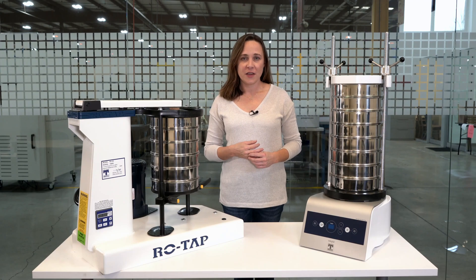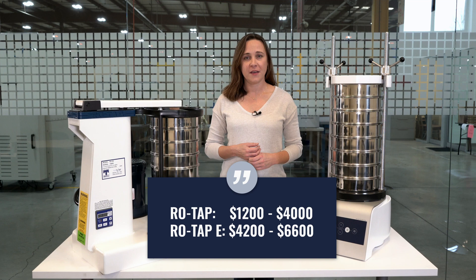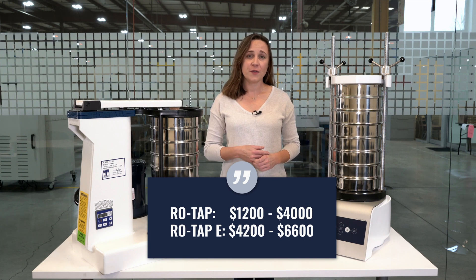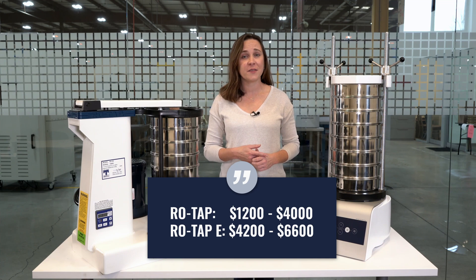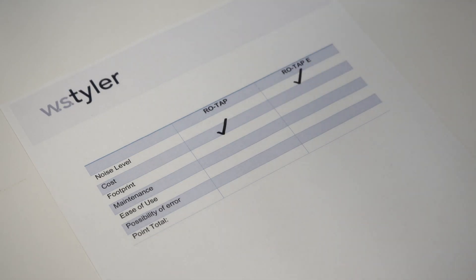The mechanical sieve shakers will range in price from about $1,200 to just under $4,000. For the ROTAP-E, those prices will range from about $4,200 up to $6,600. So in this category, the check mark goes to the mechanical shakers.